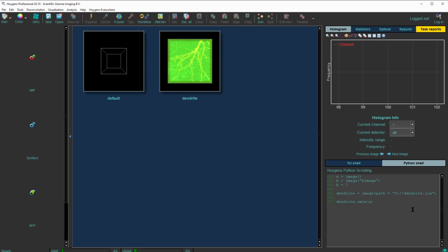Now theoretically this should be enough, but we could also specify the new name of our destination image. Let's call it dest, and let's say we want to use 5 iterations because it's just a simple test. And if we want to use this image later, it's also useful to assign it to a new variable. So let's say new equals the result of this operation.